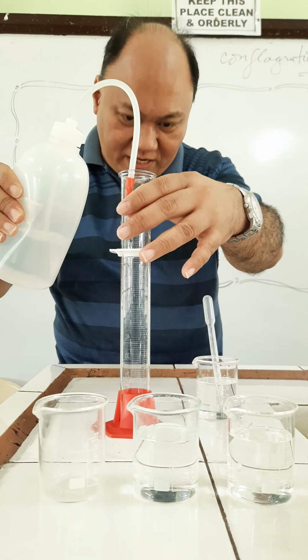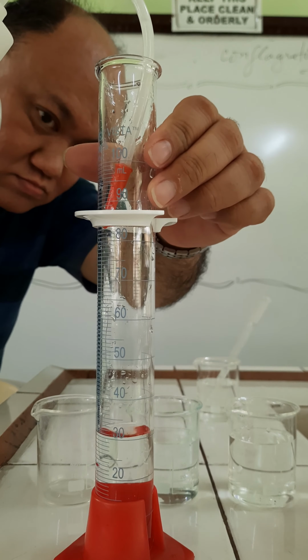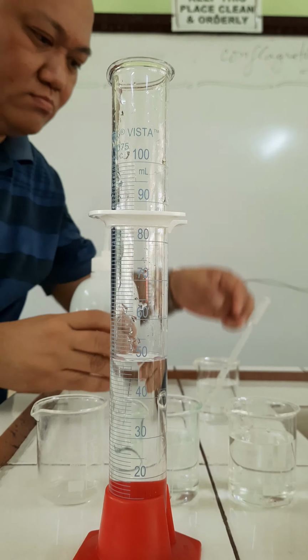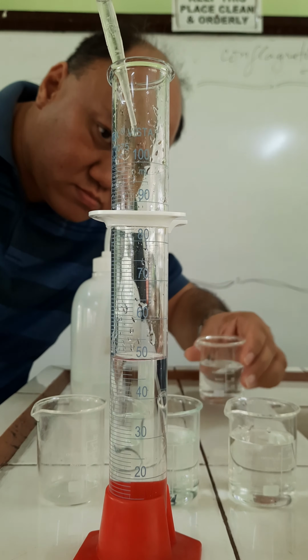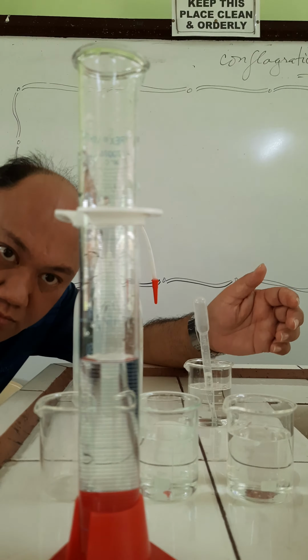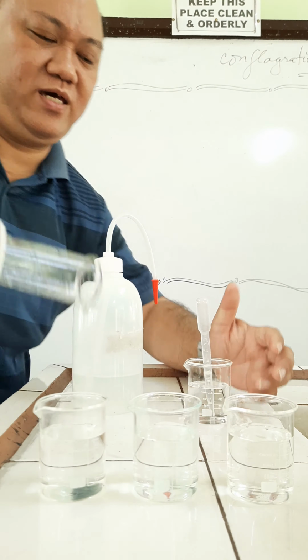I'll fill this up again with 50 ml. Okay. And now I'll place it on the third beaker, beaker number 3.